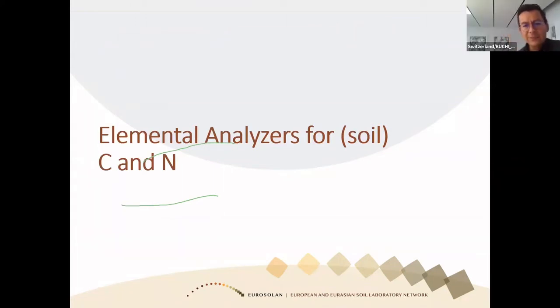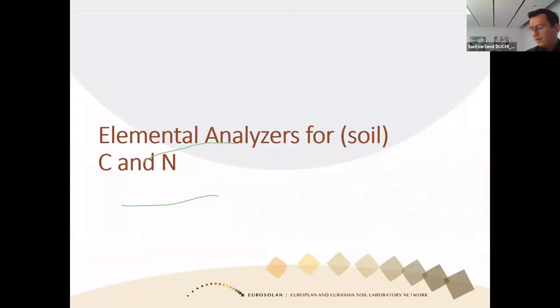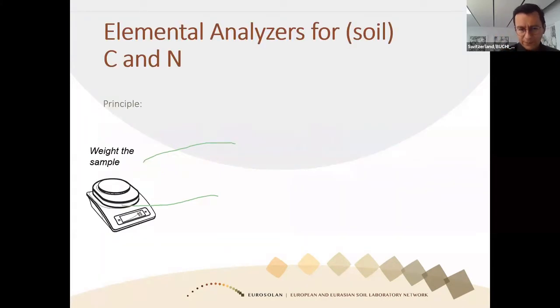I'm going to talk about the elemental analyzers for soil total carbon and total nitrogen as well. In the KLAD instrument that we saw before, we only analyze total carbon. With the elemental analyzers, we have the possibility to analyze total carbon and total nitrogen, as well as, in some cases, other elements like sulfur.